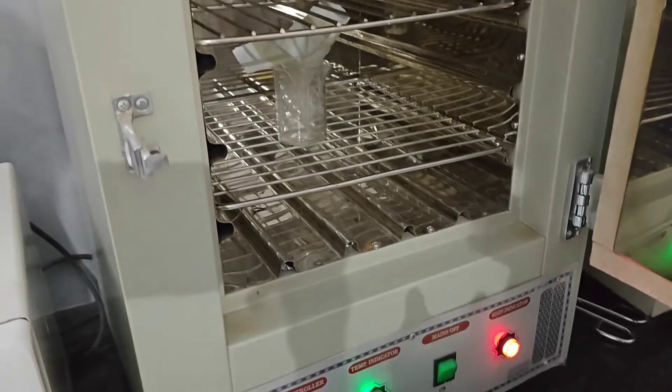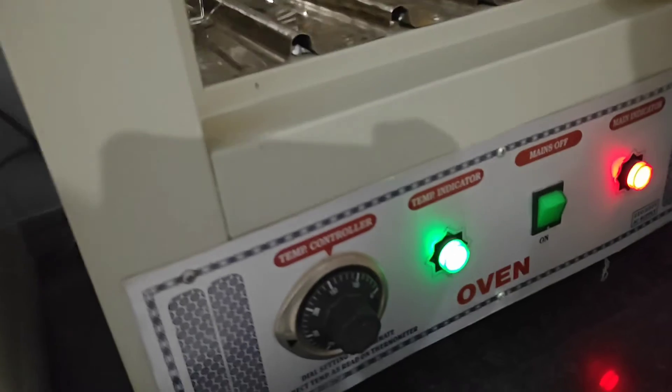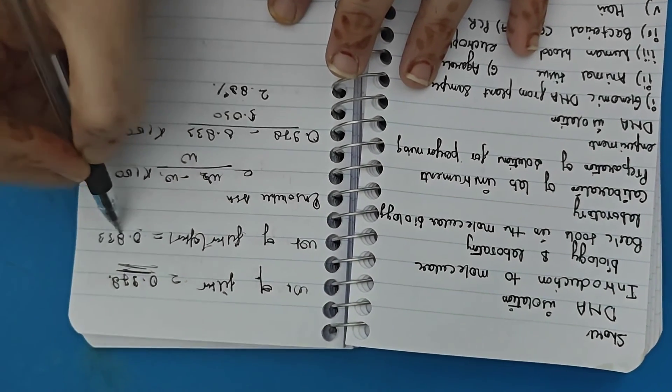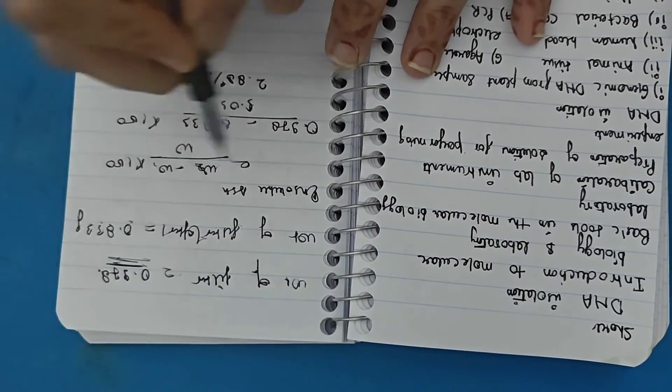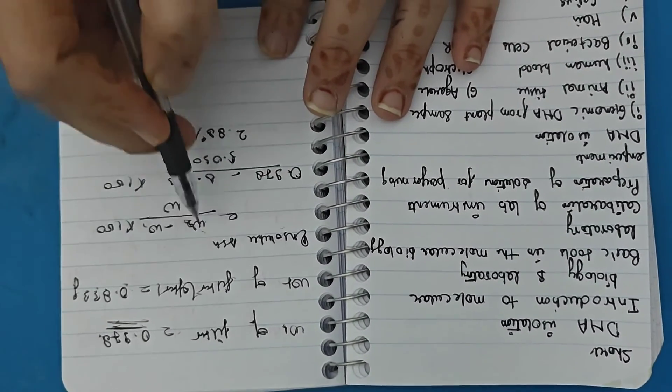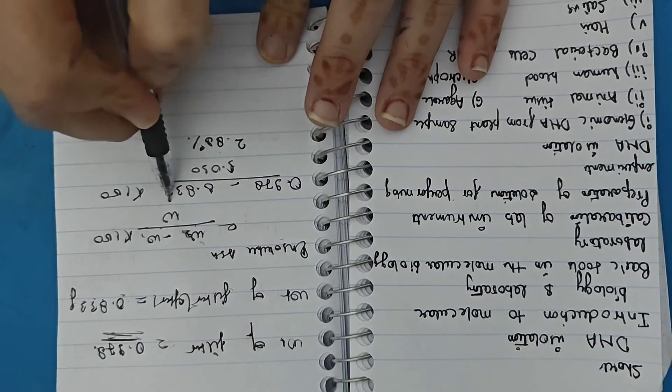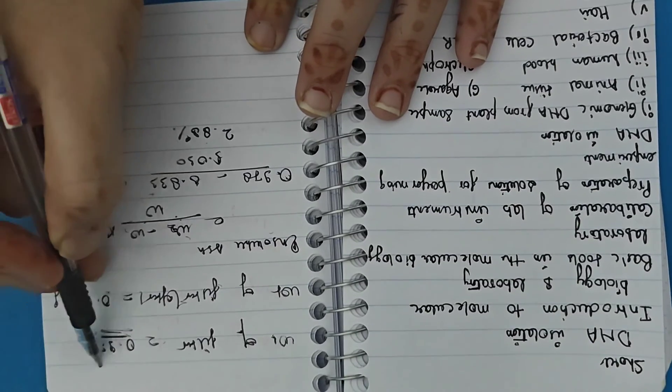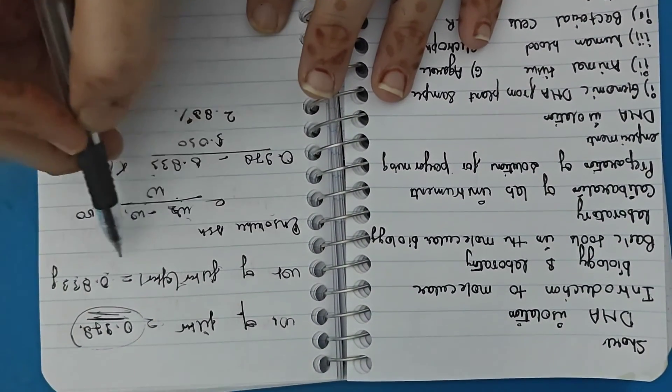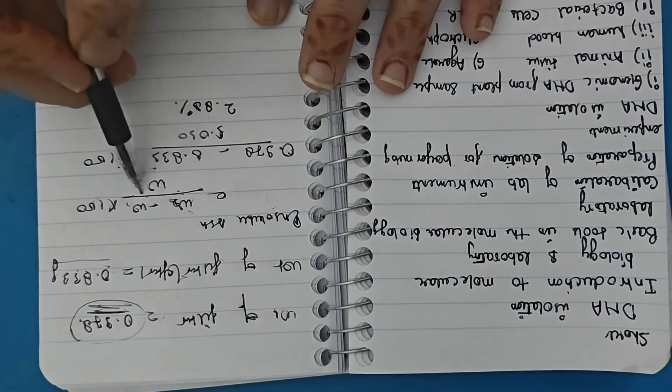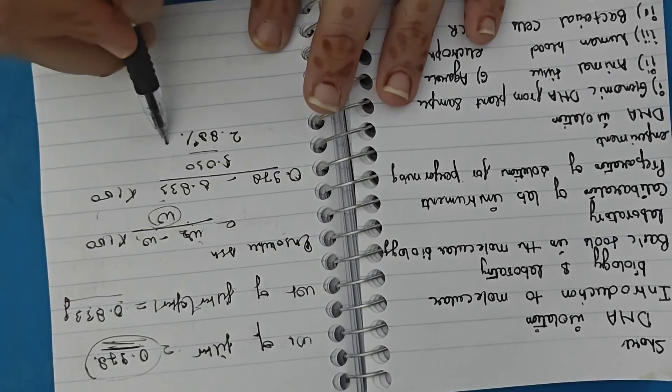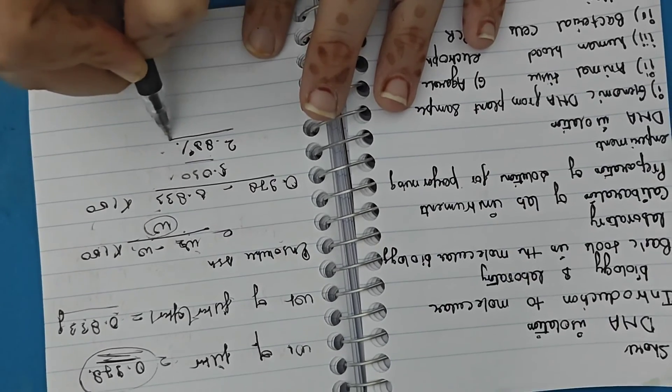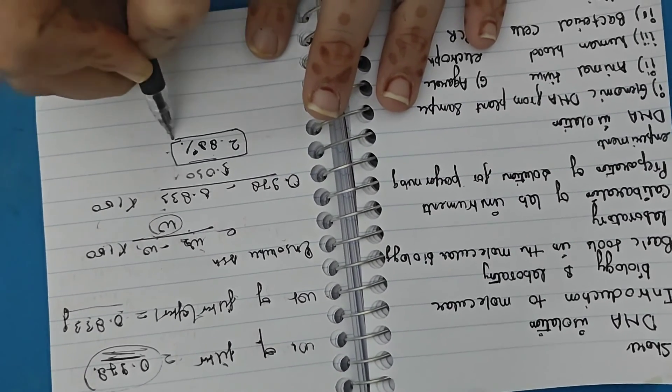Here the filter paper is dry and only the ash content is remaining. After drying, the weight of the filter paper is 0.833 grams. Now put the values in the formula that is W2 minus W1 divided by W multiplied by 100, where W2 is the weight of the filter paper before drying and W1 is the weight of the filter paper after drying and W is the weight of the sample. Now put all the values in the formula and you get the total insoluble ash that is 2.88%.